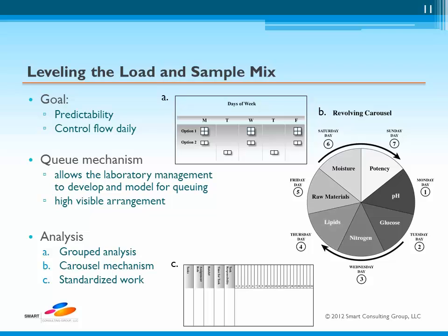analysis batch. In practice, the samples arrive daily in a centralized receiving area in the lab where labeled and numbered trays are arranged together with appropriate documentation. This is a highly visible arrangement which utilizes visual factory techniques to ensure that the work is according to a standardized work pattern and to a repeatable cadence or drumbeat known as a takt time. Once an effective queuing mechanism has been defined through analysis and assessment, the issue is to effectively execute the analysis to meet the goal of the standardized cadence for that process.